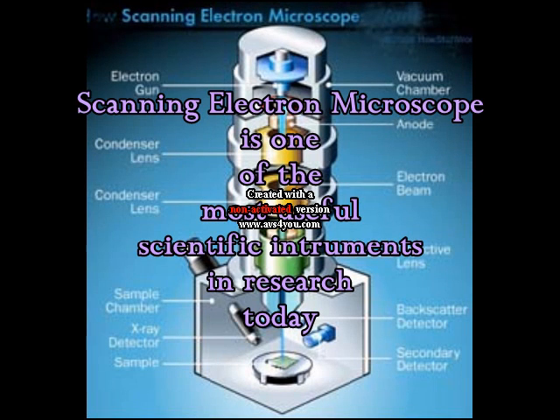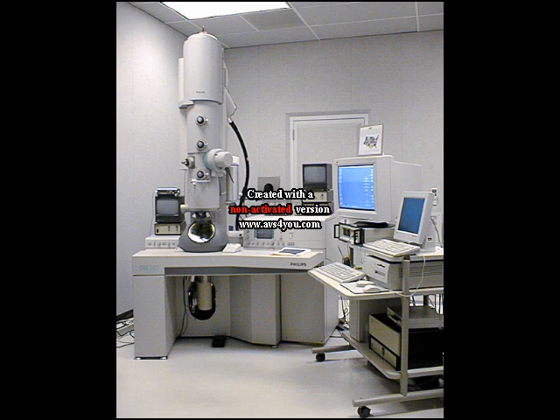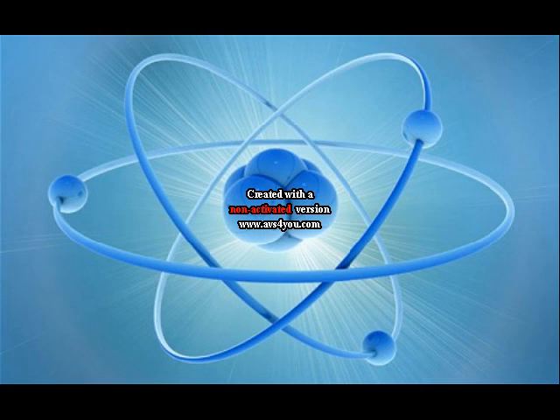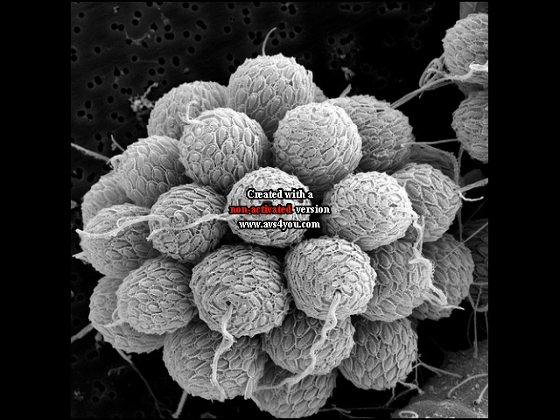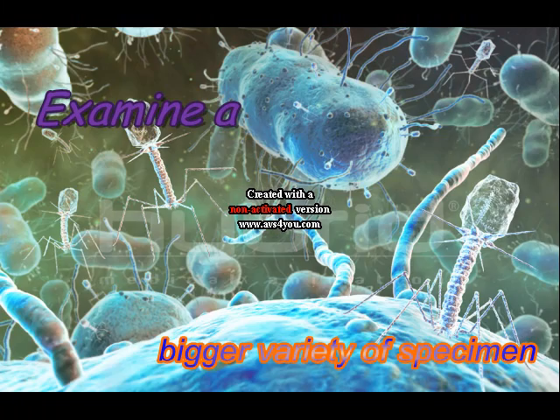Scanning electron microscope is one of the most useful instruments in research today. Scanning electron microscope, known as SEM, uses electrons instead of light to form an image, and it allows researchers to examine a bigger variety of specimens.